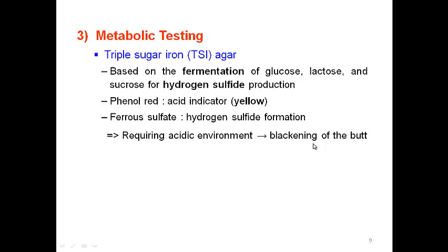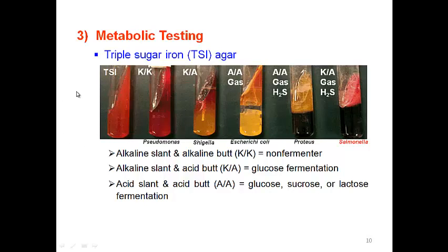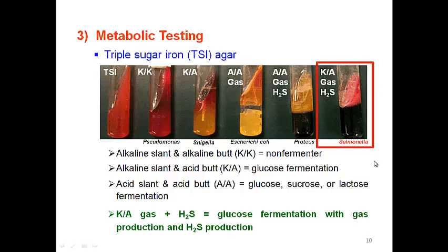The last biochemical step uses TSI and LIA. TSI agar has three different sugars: glucose, lactose, and sucrose. Salmonella only ferments glucose; phenol red serves as an acid-base indicator, turning yellow under acid conditions. Salmonella produces acid and gas from glucose in TSI agar. This test tube shows an alkaline slant with gas and hydrogen sulfide that makes a black butt, confirming that Salmonella ferments only glucose with gas and hydrogen sulfide production.